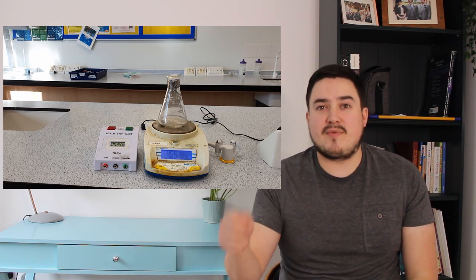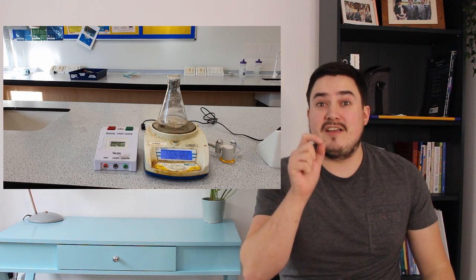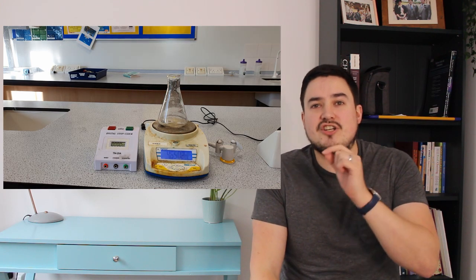For all of these, it's really important, if you're asked to describe the practical, you remember to include a timer and that you're measuring these changes over time. If you don't mention the idea of over time, you're going to miss out on marks on these questions. For example, the first one is timing the reaction, the second one is measuring the volume of gas released over time with a gas syringe, and the final one is measuring the change in mass over time using scales.